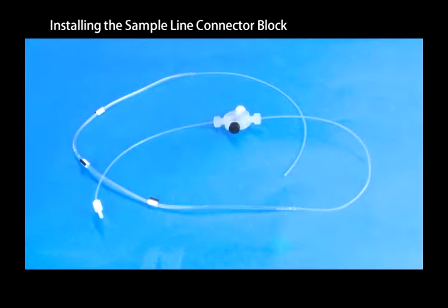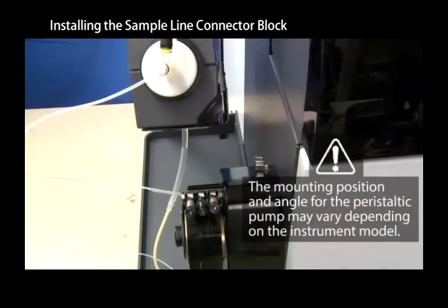Connect the peristaltic pump tube to the opposite end of the supplied sample tube. Clip the connector block into the ground clamp.